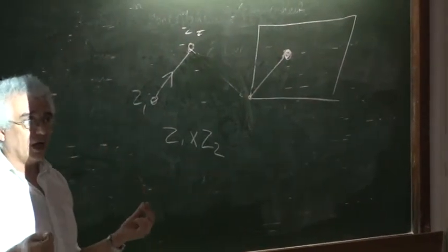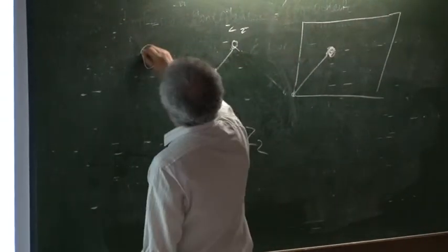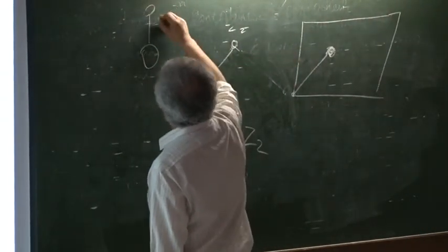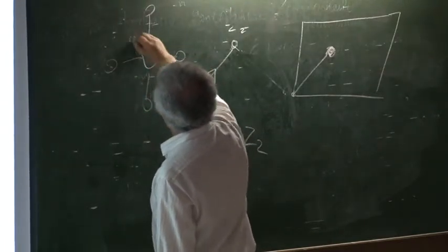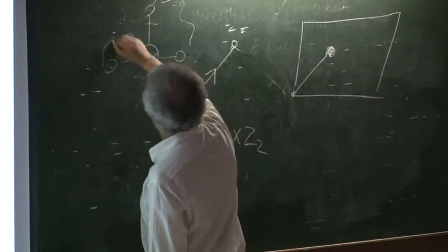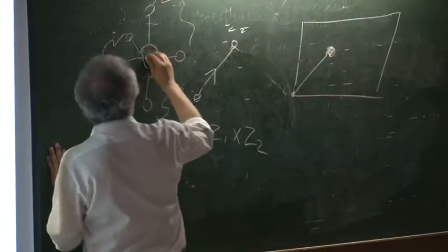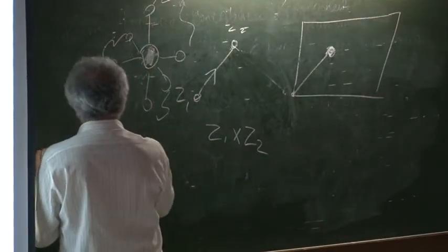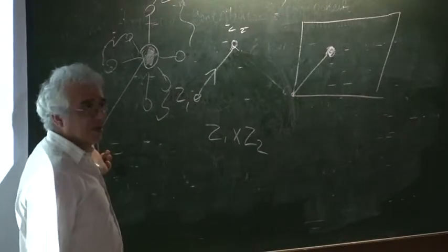So, if you have a system where you have, for example, a big molecule like this with some kind of organic group attached to it, let's say something like this, and you're looking at the vector between this and the next heavy atom.